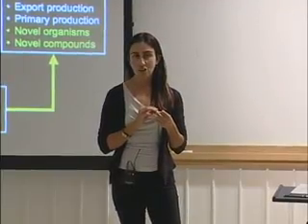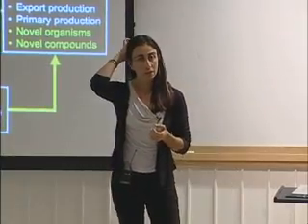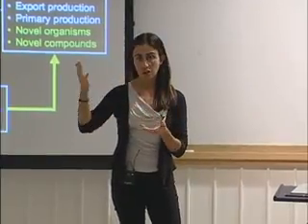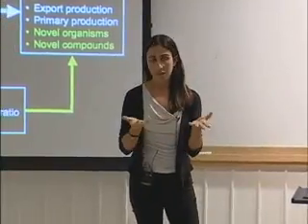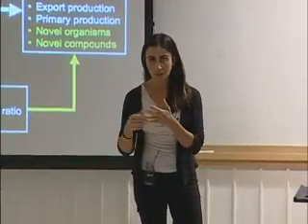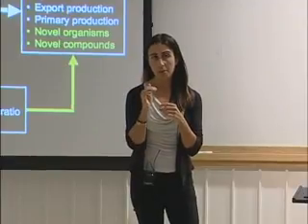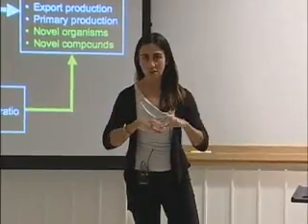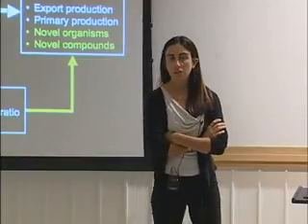Some people use antibiotics, but I prefer to stay away from antibiotics. But as I said, if you keep your cell densities really low and work with large volumes, you should be okay. In terms of the subset of proteins that you pull out from Emiliania huxleyi in this case, we only see the most dominant proteins. If a protein is produced in low abundance, we won't see that. So you don't pull out all the proteins, just the most dominant ones. We get, I think, something like 150 major proteins.